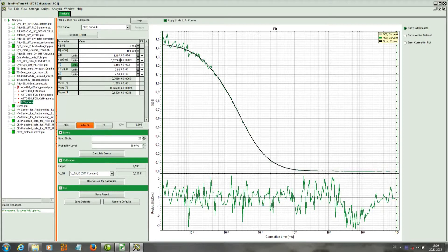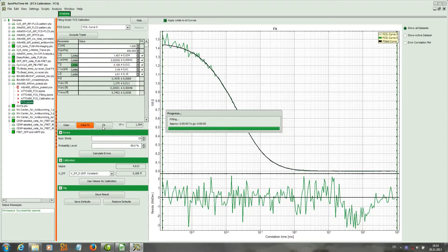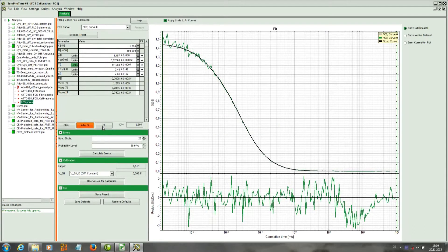Here especially the diffusion time is fitted. Now we have to enter the known diffusion coefficient and fit again to update the calculation of the confocal volume. As you can see, three confocal volumes are calculated: the upper one from the concentration, which is not known in this case; the second from the diffusion coefficient we just entered; and the third is the mean of both.